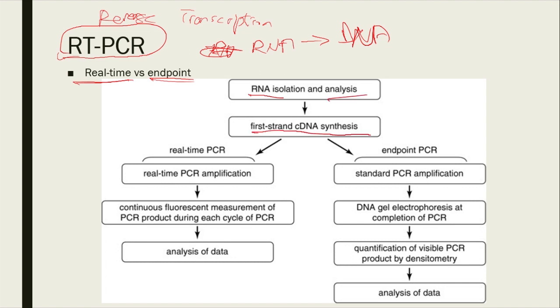Now, in the real-time PCR amplification, there is a usage of a fluorescent measurement so that you can see strands being produced in real time, and it's a little bit fancier machine that pharmacy doesn't have, but in the biology department, in the Cohen Science Building, we do have a RT-PCR machine where you can utilize fluorescent molecules to get an idea of how much DNA is being produced every cycle. Basically it's a quantitative measurement. Okay, it's a quantitative RT-PCR. So sometimes people call it like that.